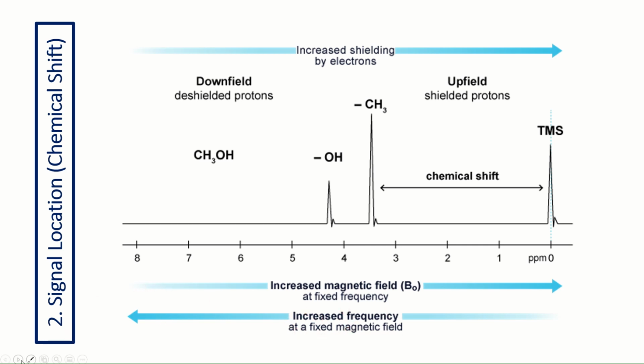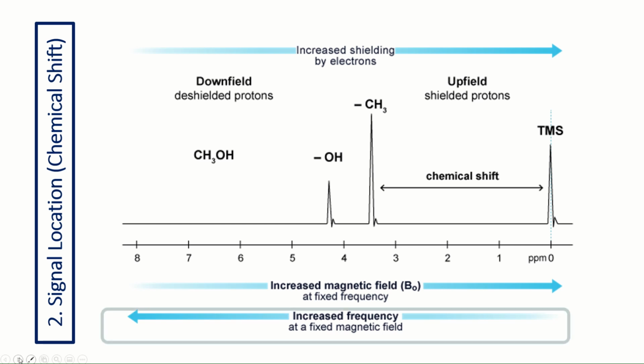And realize that in today's modern instruments, we use white light, so therefore we're using a range of frequencies, or white radio, so we use a range of frequencies at a fixed magnetic field.